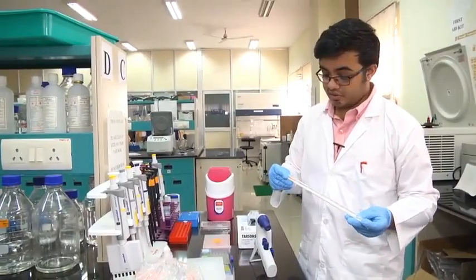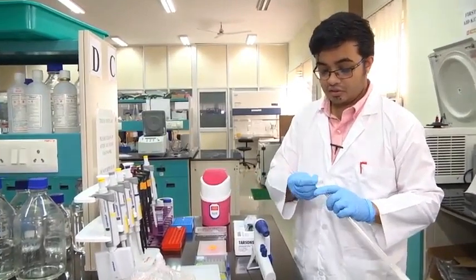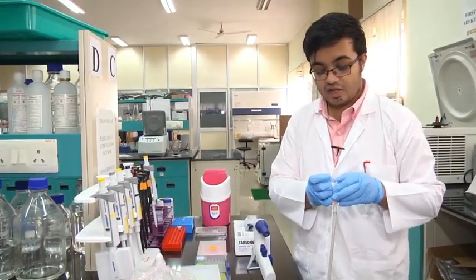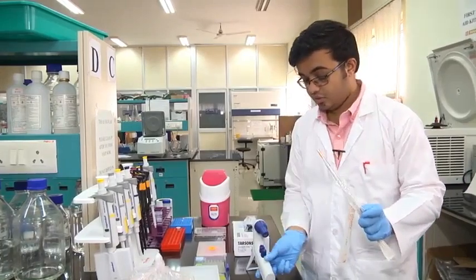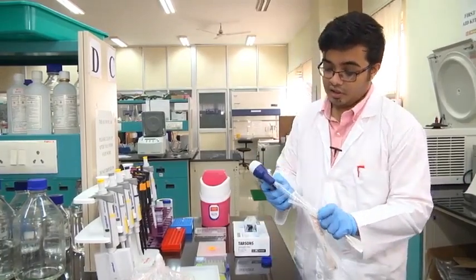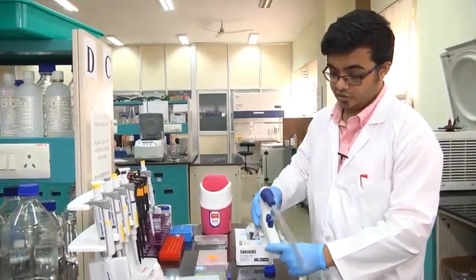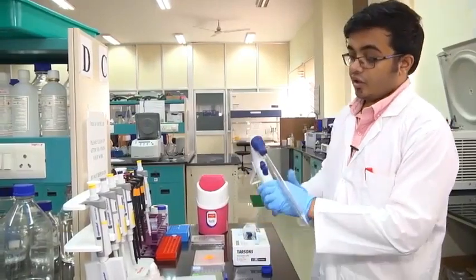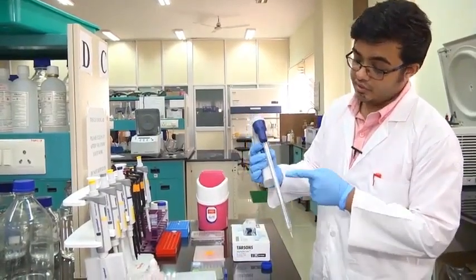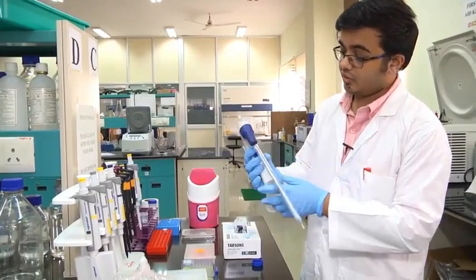So this is present in a sterile format. It's present in a sealed condition. Once we break the seal, we have to use it up. So I'm going to just take out this serological pipette, affix it to this, and remove it. And this is what we are going to use. You will notice that this can collect a volume of up to 10 milliliters.